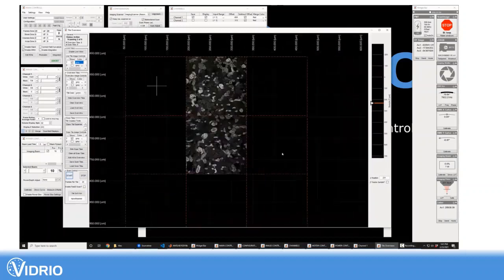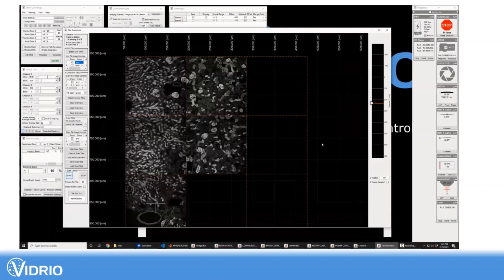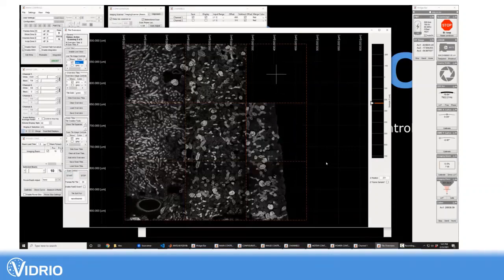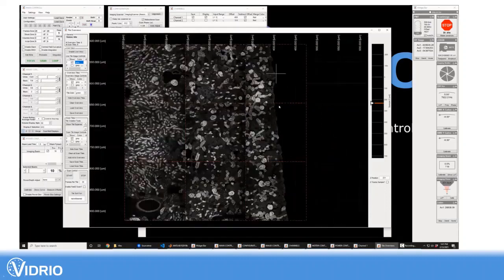So this is an approach that will come out this year, probably in the first half of the year. And we're pretty excited about it. You have to have good stage alignment and good stages to be able to do this. So you get really nice, well-aligned segments, but it's a feature that people have really sort of wanted and demanded.